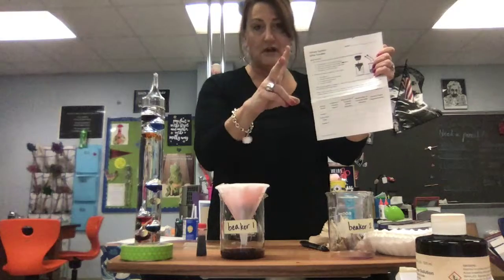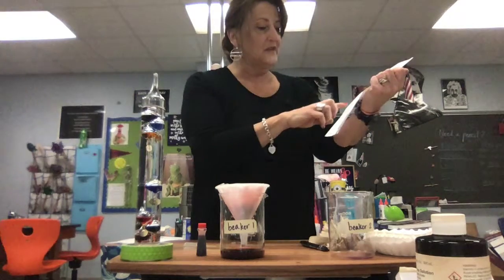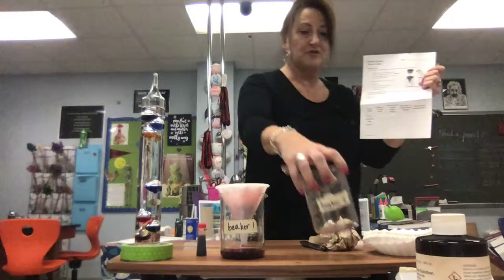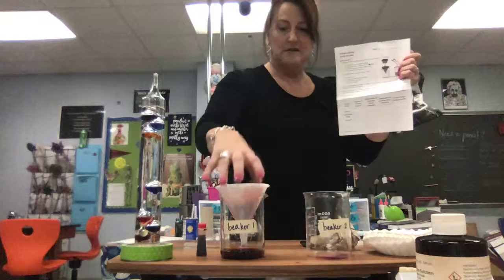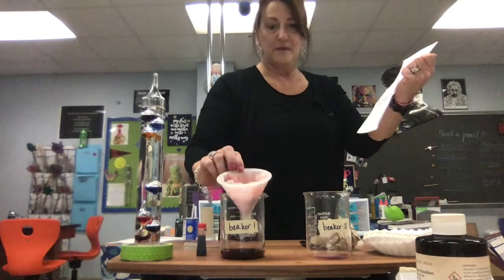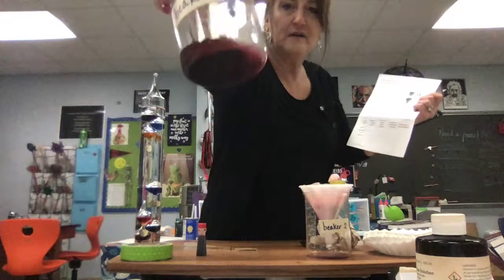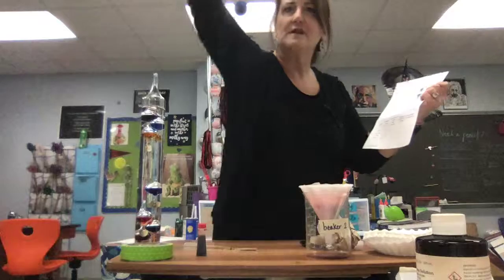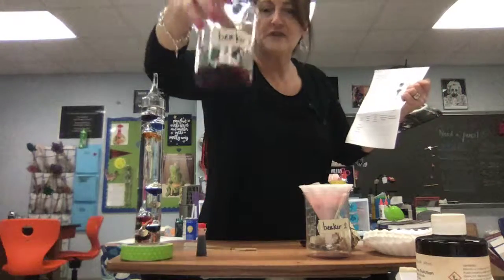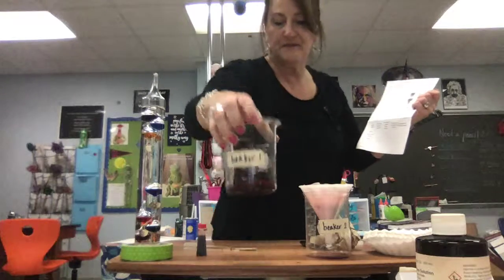So those were your observations. Okay, really, you can just use sight. Observations of contents after filtration. So now beaker 2 is empty. It's got a little of that purple in it still. Remember the filter paper. And then beaker 1 is much clearer. There's definitely still some cornstarch in there, but then how would that cornstarch get filtered out?